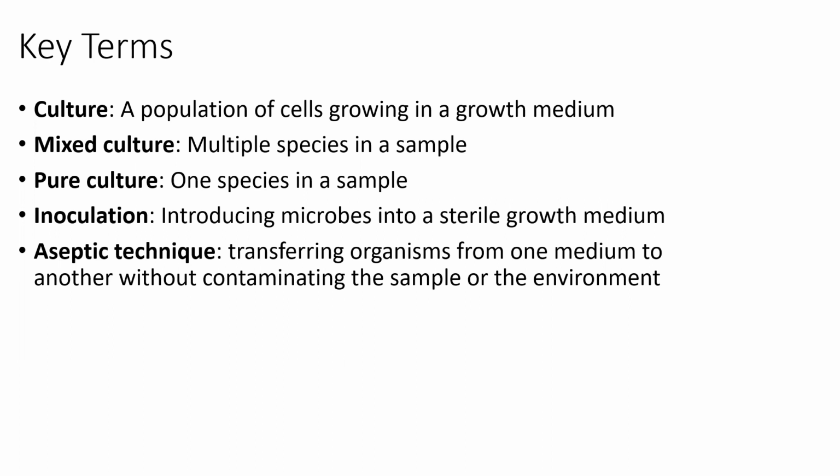Now, in the two examples I just gave, those were pure cultures. You only have E. coli in your broth, that is a pure culture. But normally when we do this lab, we actually give you a mixed culture, which means there's more than one species within a sample.